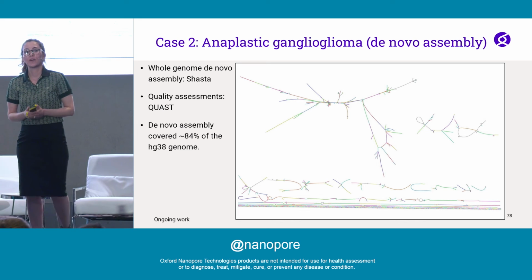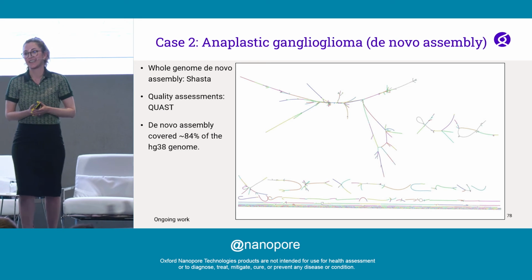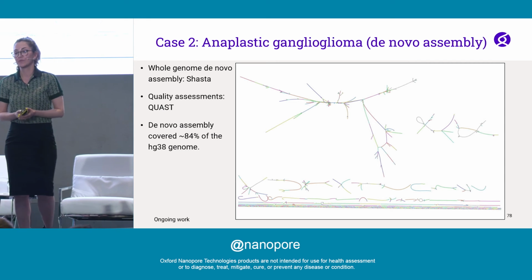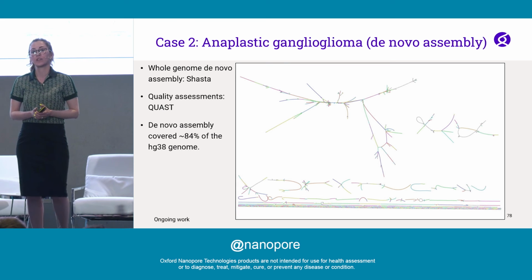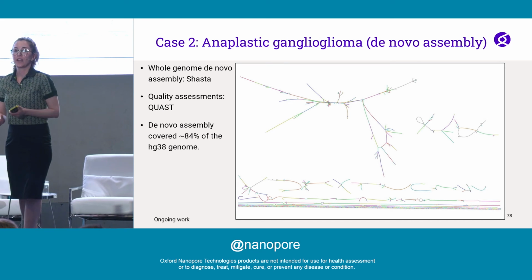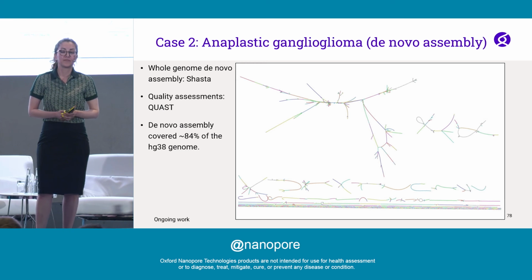But unfortunately, we are still dealing with the fact that this is a diploid genome, so we are still working on whether it makes sense or not. We are adding phasing information, but this is ongoing work, so we don't know how much that could be improved.